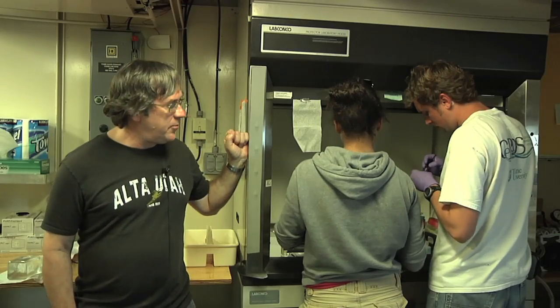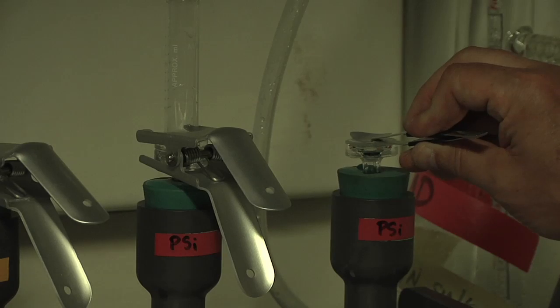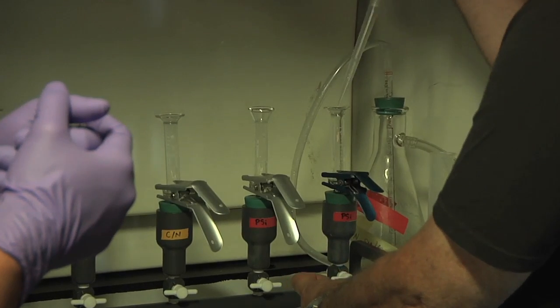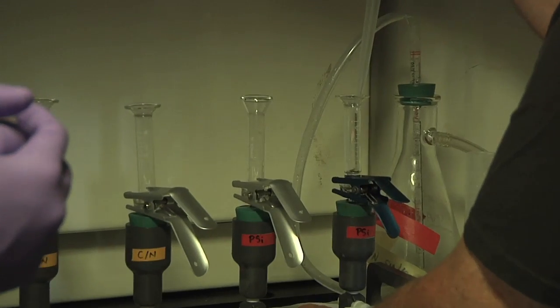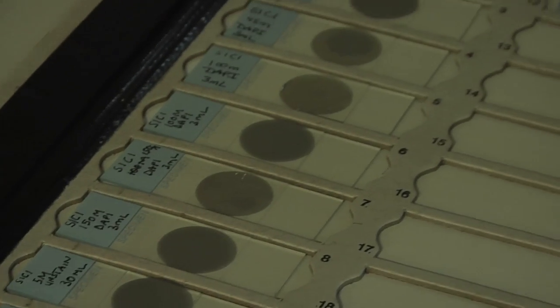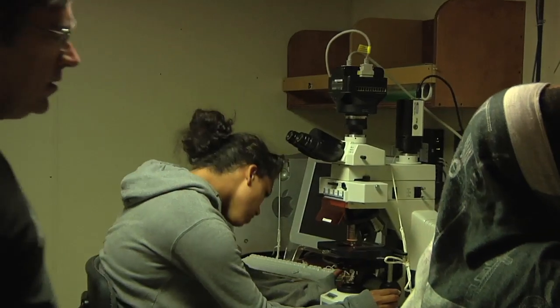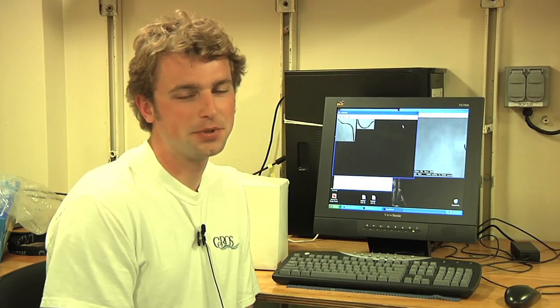So we're preparing samples here for microscopy to look at bacteria, and we're staining the samples with DAPI. And DAPI is a stain that lights up the DNA in cells and allows us to visualize them under the microscope. My name is Charles Schutte. I'm a second-year PhD student in the Department of Marine Sciences at the University of Georgia in Athens, Georgia.